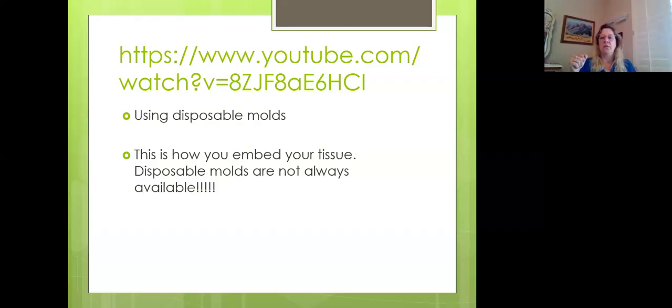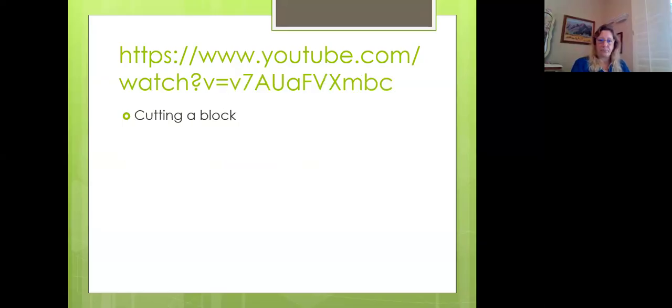And so you can't always rely on the hope that when you get out into industry, you're going to have disposable molds available to you. So if you're using these, you do need to master the building of your own block before you rely on disposable molds.